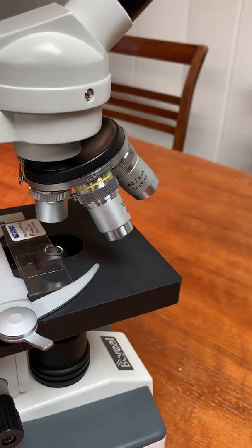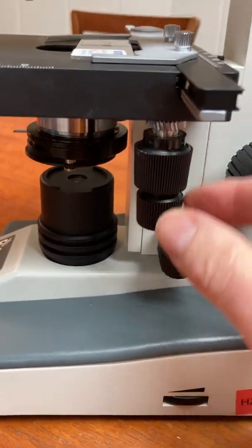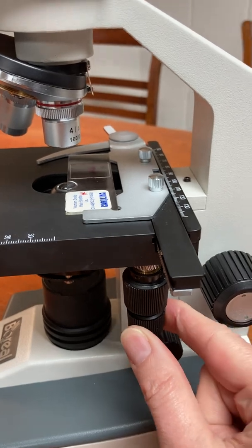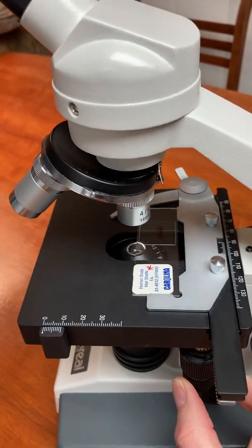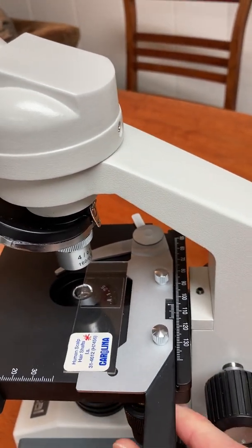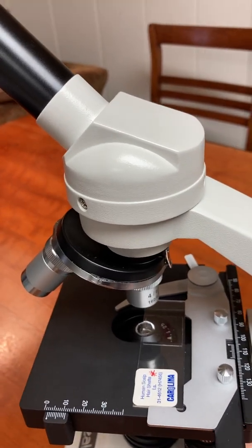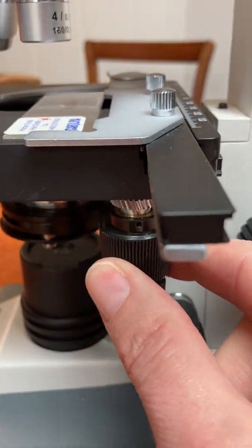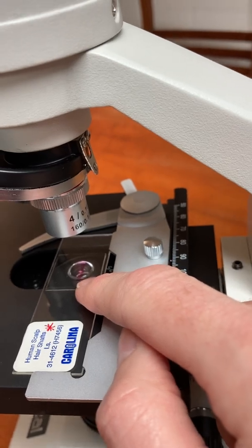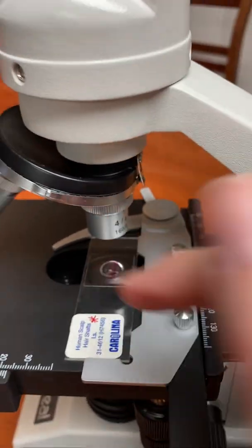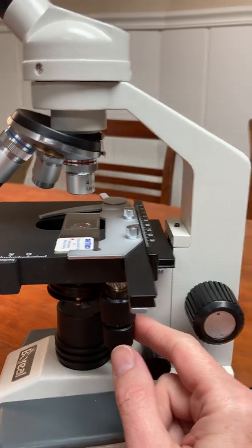The stage control knobs are on the other side. Here they are. There are two here and here. One of them, when you turn it, moves the microscope slide back and forth in that direction. So you would want to line up your specimen, which is here, with the lamp that's there. And then this other knob underneath moves it in the other plane. So look how I lined up the microscope slide specimen there right on top of the lamp shining through. So these are stage control knobs because they control the stage, right?